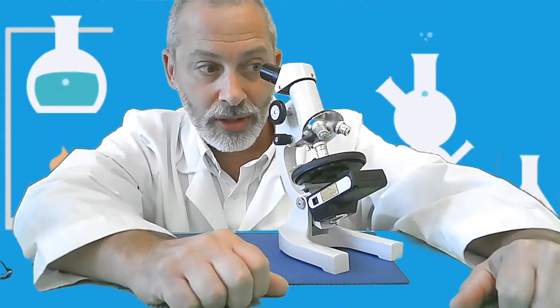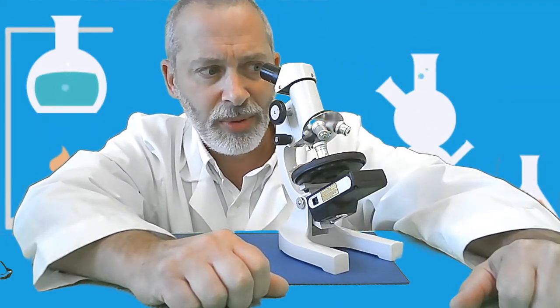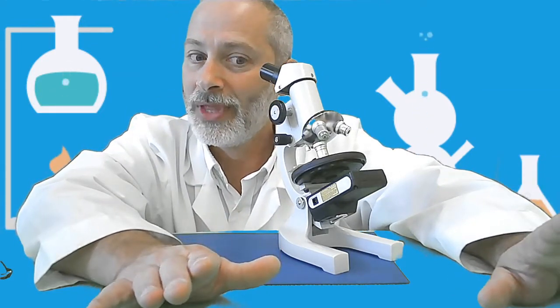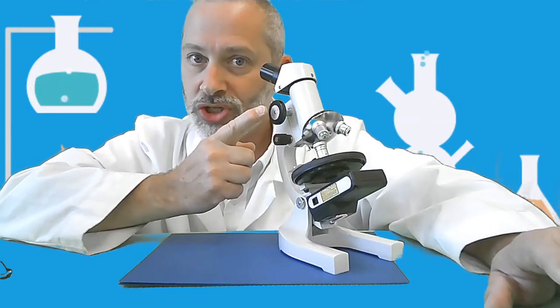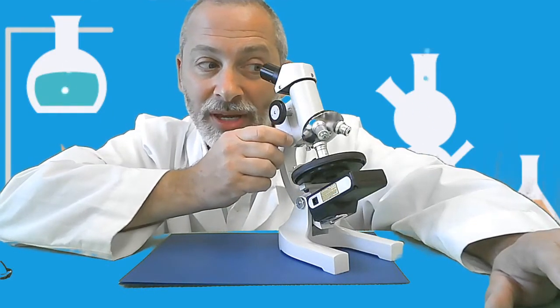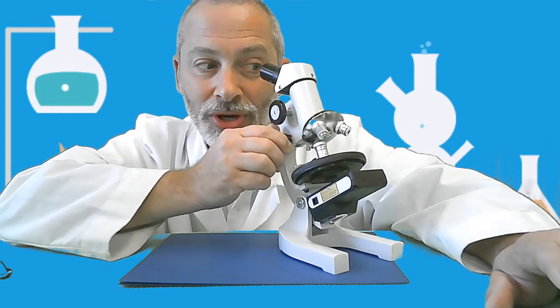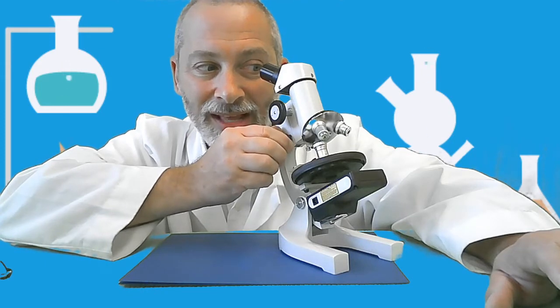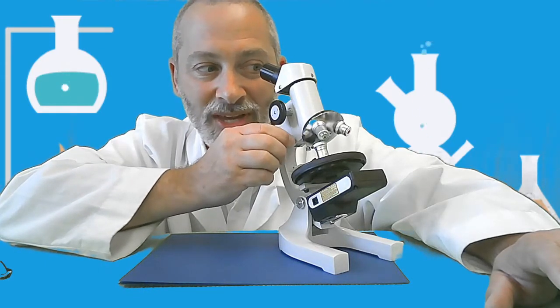And now when I look underneath, oh, it's a little bit out of focus again. That's okay. Don't use the coarse adjustment knob. Use the fine adjustment knob to turn again. Oh, there we go. And get the image in focus.